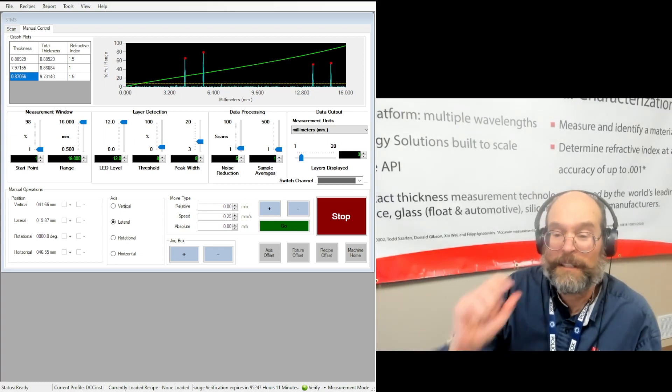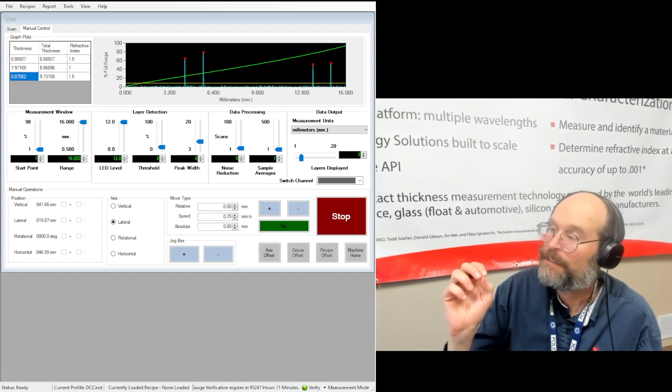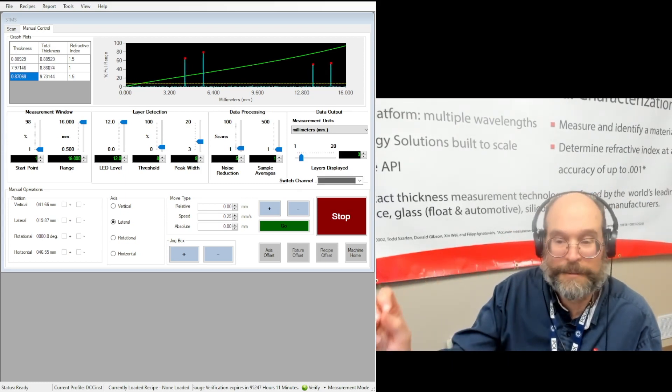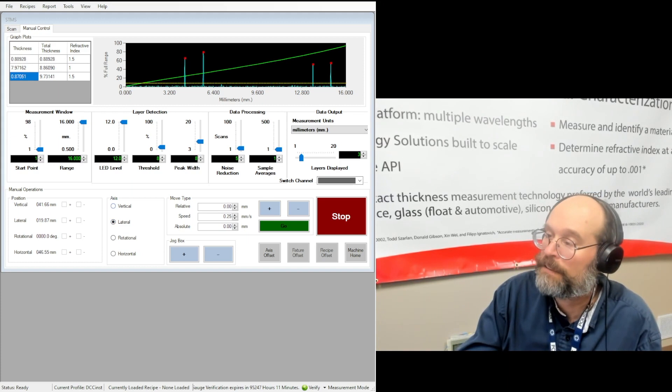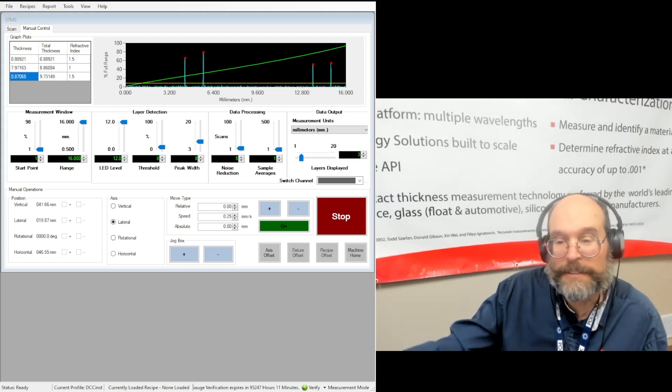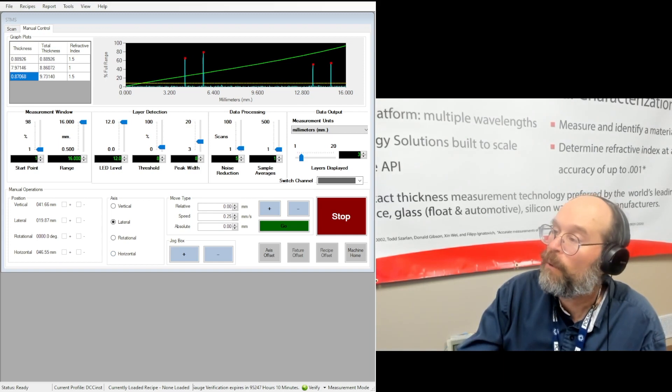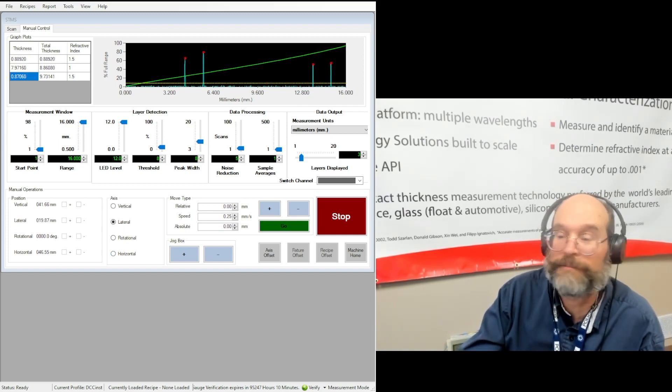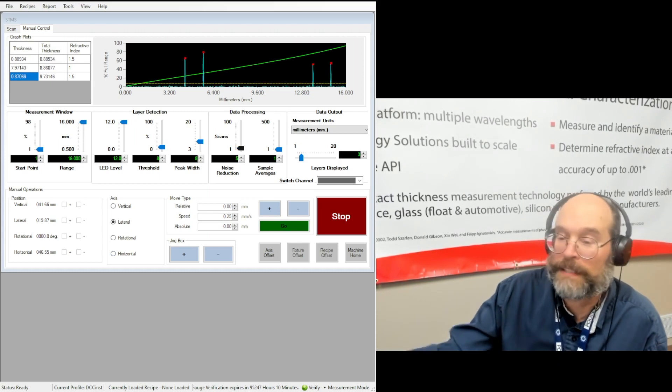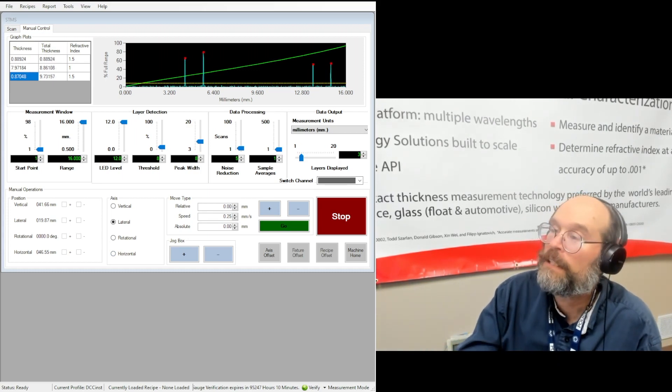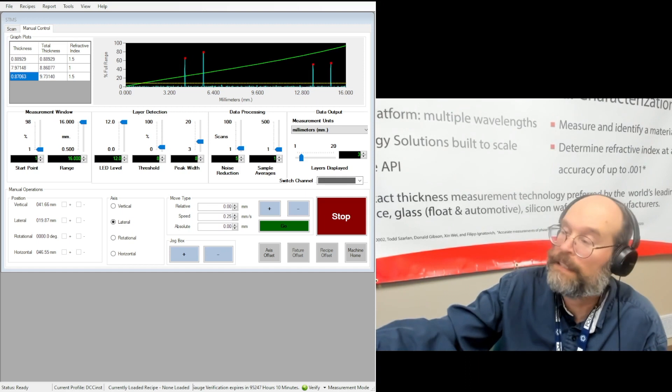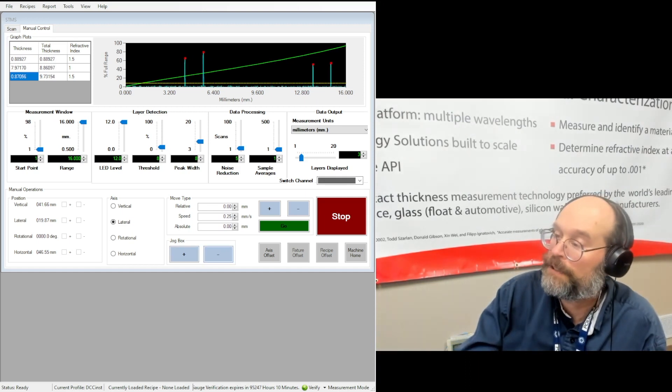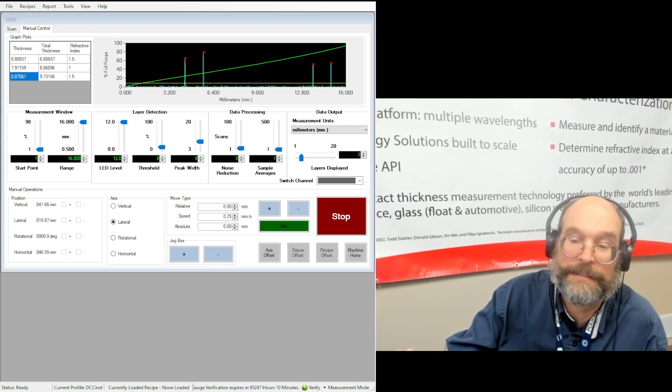What I find, though, is the first thing that you should do is get into the manual control and move the stages around in vertical, lateral, rotational, and horizontal until you have a signal where you want to start your scan from. We can go over that in more detail maybe in another video, but let's say we've done that already and you use the jog buttons and you pick your axis and you can get your signal in place.